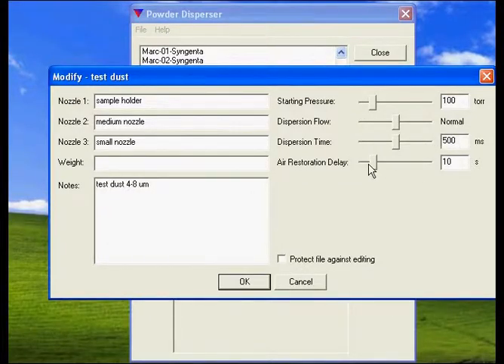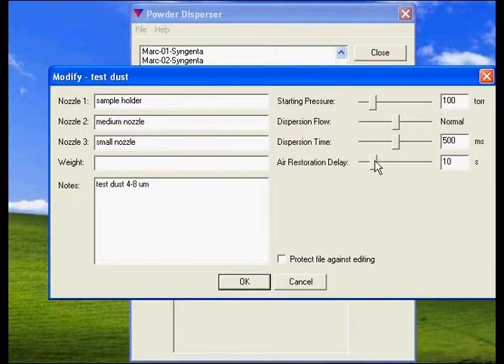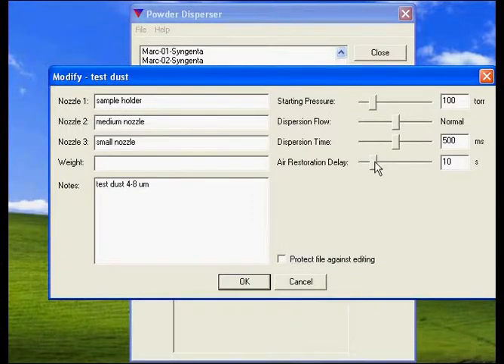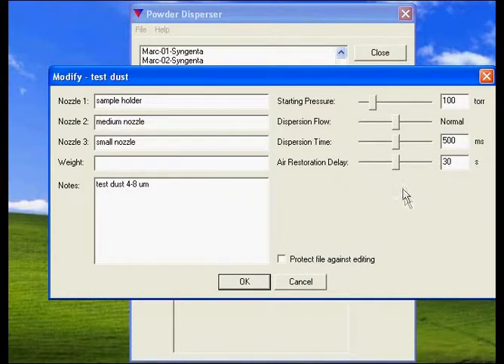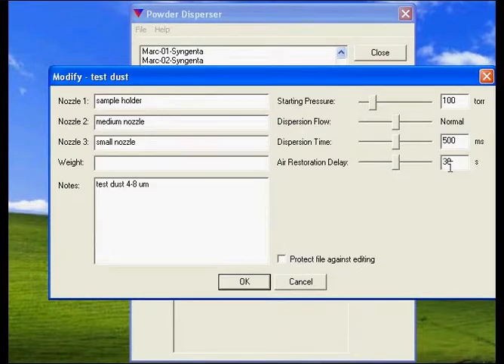The next setting is the amount of time between the dispersion and when the air rushes back in to remove the vacuum. I'm going to make sure that I have plenty of time, so I'm going to put it at 30 seconds.